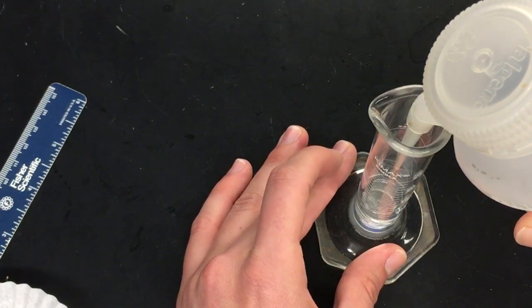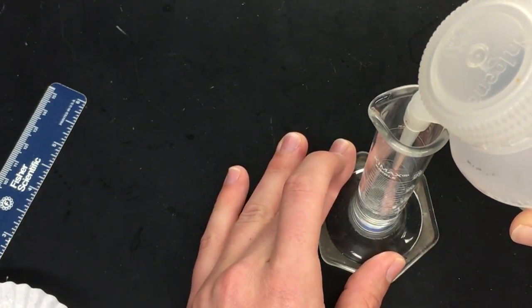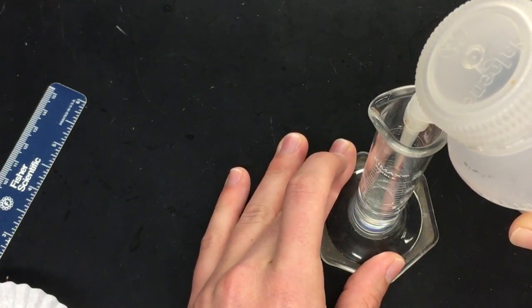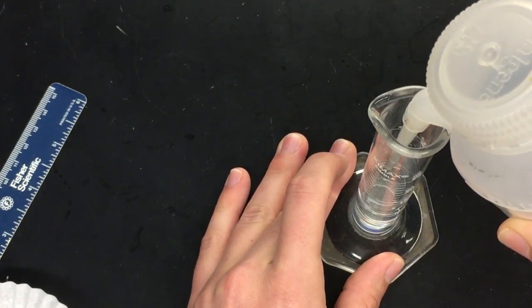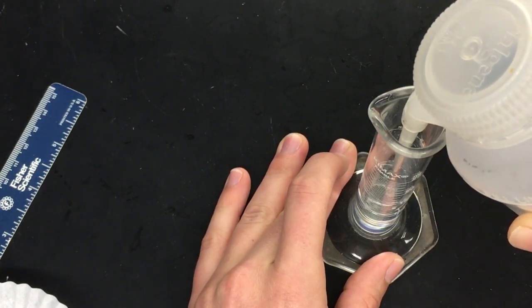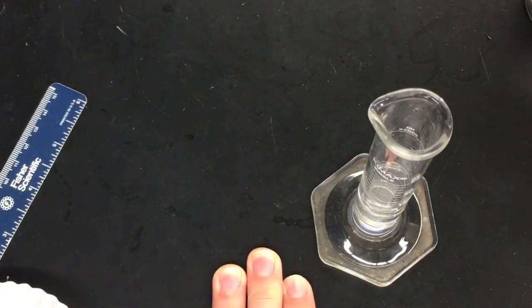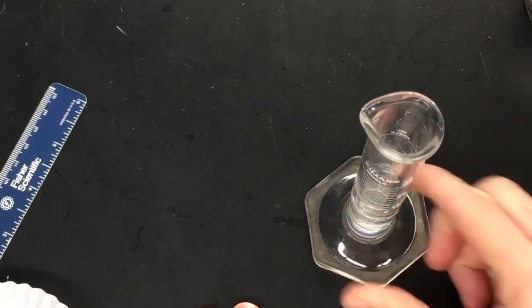I'm going to take it all the way to about 15 milliliters. Now, here's the thing. A lot of you would be tempted to go drop for drop until it's right on the line at 15 milliliters. That's not actually what our goal is. In fact, maybe on purpose overshoot or undershoot to some arbitrary value. You can see I got a little bit on the sides there. It's not going to affect our measurement too much.